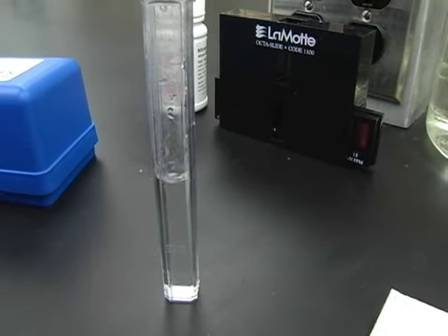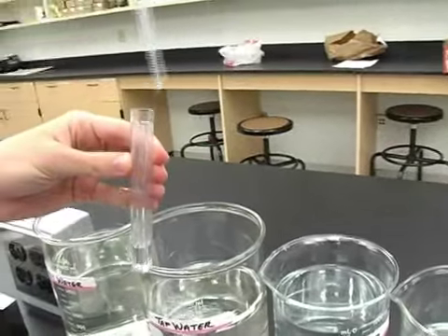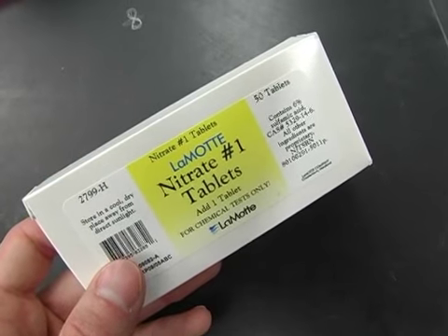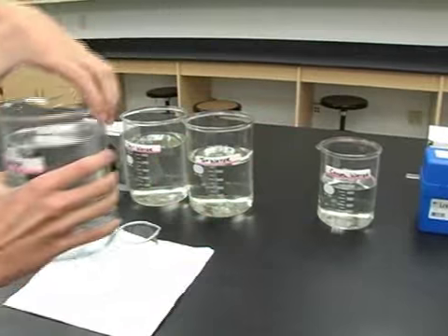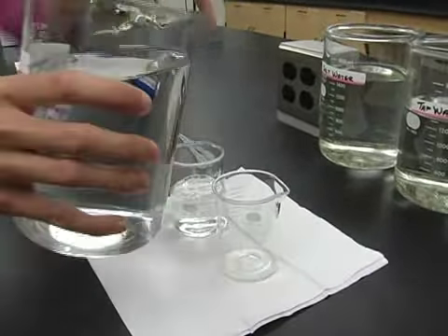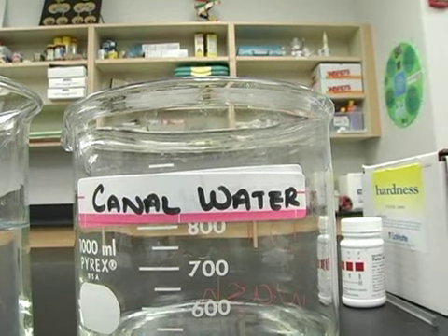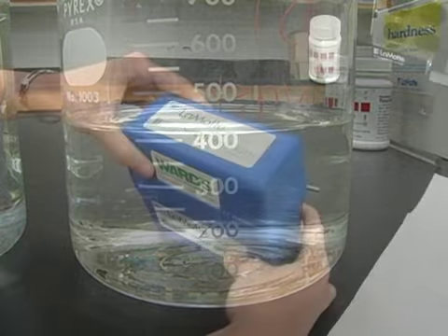The first test we will conduct is for nitrogen. Nitrogen is one of the most abundant elements on Earth. 80% of the air we breathe is nitrogen. It is found in the cells of all living things and is a major component of proteins. However, too much nitrogen in aquatic systems can deplete the oxygen levels in the system, thus killing off aquatic organisms. Nitrogen pollution of our water systems is caused by poorly operated water treatment plants, sewage leaks, and agricultural runoff.